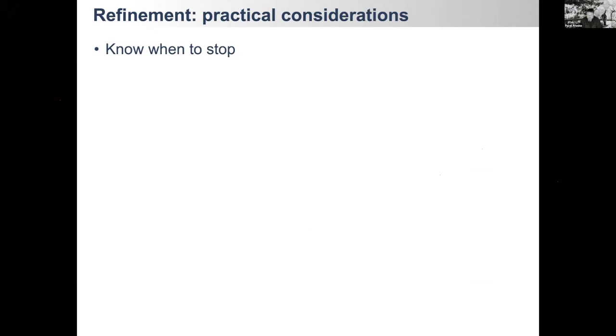Say you refine your structure at 2 angstrom resolution and you get a particular R factor. It would make sense to go to the PDB and look at a few thousand other structures at 2 angstrom resolution and see what R factors they have. And that statistically might suggest whether you are in the ballpark or not. So that's the idea.